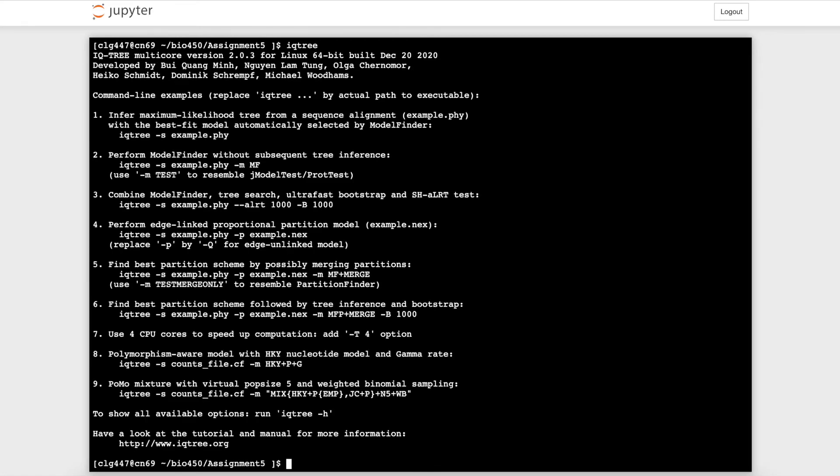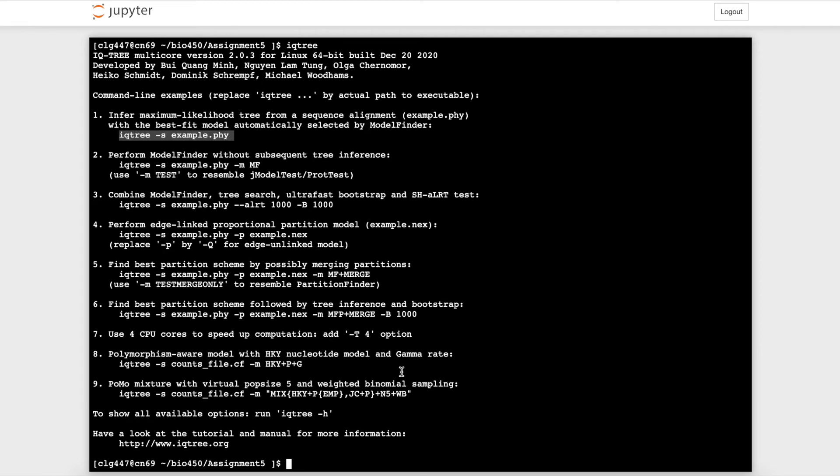As you can see, it provides several command line examples that you can execute with IQ-Tree 2. IQ-Tree 2 has many capabilities, so I don't have time to go through all of them, but the main draw to this software is this first command. Here we will run the first example and infer a maximum likelihood tree from our sequence alignment.